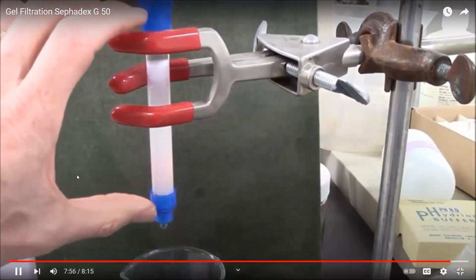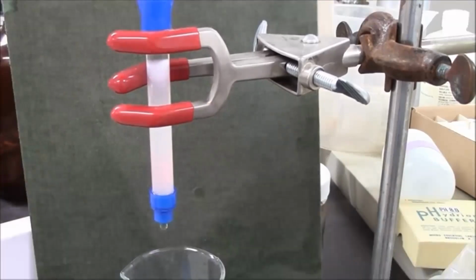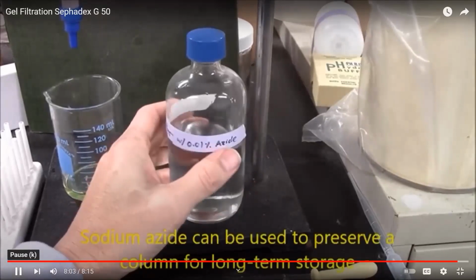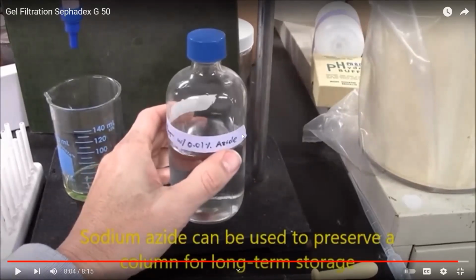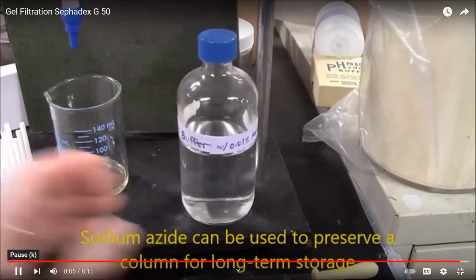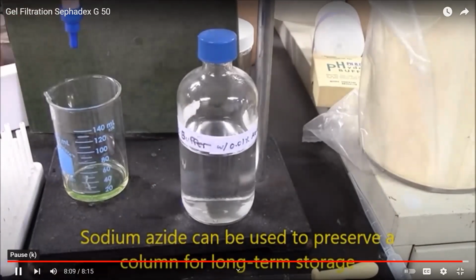Sometimes azide is added to the buffer to prevent growth of microorganisms. Here's Tris buffer with 0.01% sodium azide. Sodium azide is actually antimicrobial, so you can add azide to the buffer and then add that buffer into the column. This makes sure that there is no microbial growth or contamination in your column, because these are very expensive beads. So you do not want to throw them; take care of them. And this will prevent microorganisms from chewing on the dextran in the column if you're storing it over a long period of time.